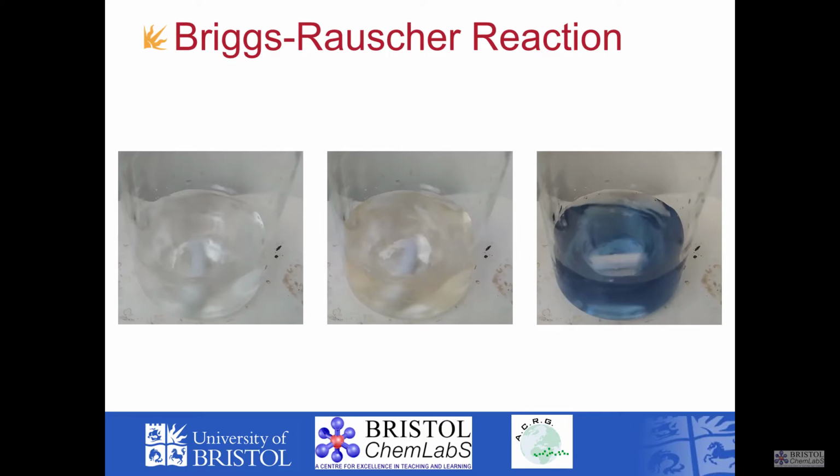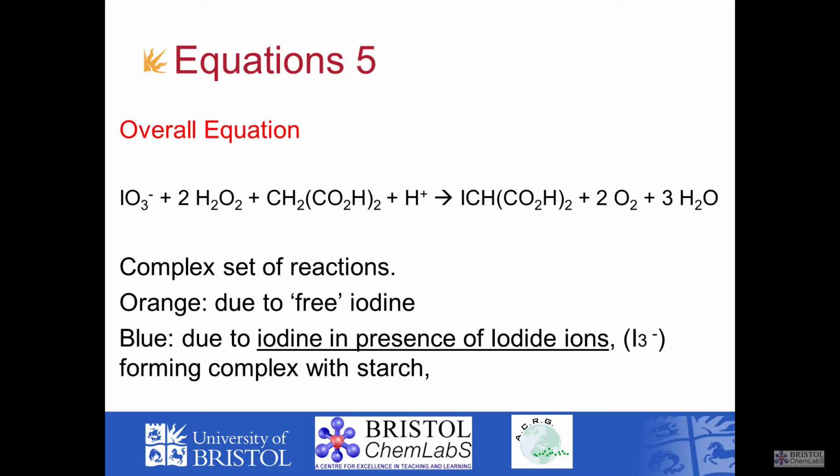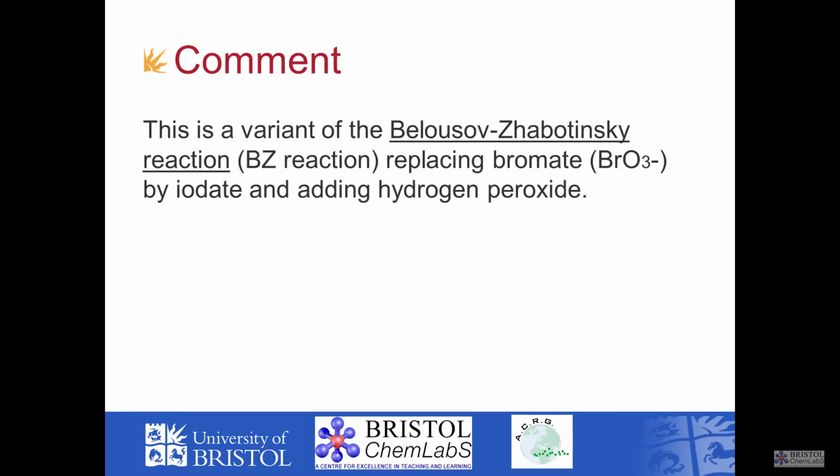The last reaction is a variation on the BZ reaction. Here we have orange coloration due to free iodine, and the blue coloration yet again due to the starch-iodine complex.